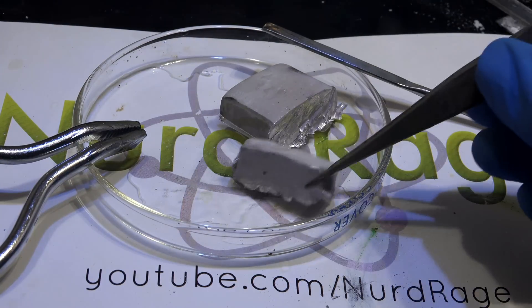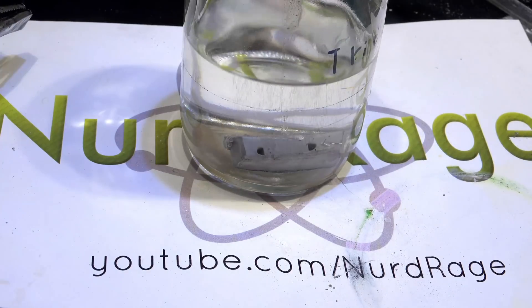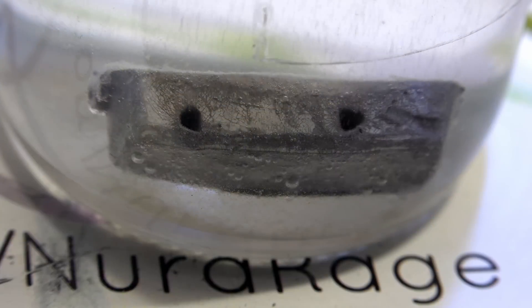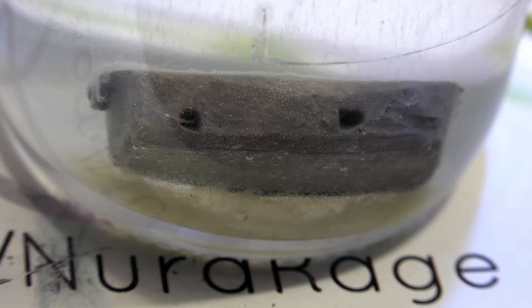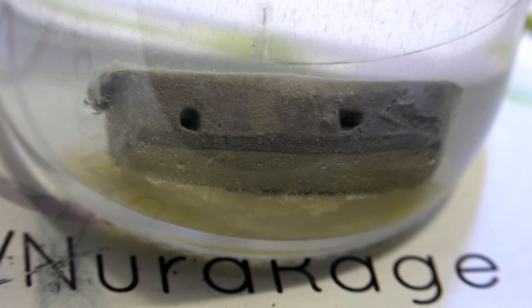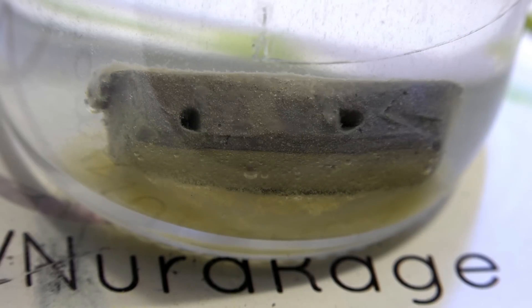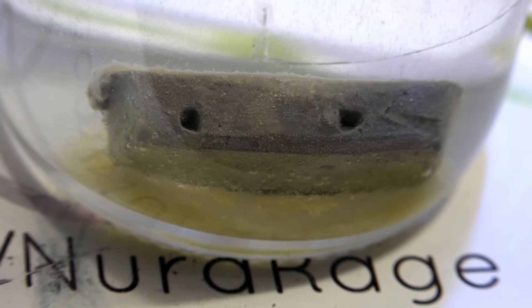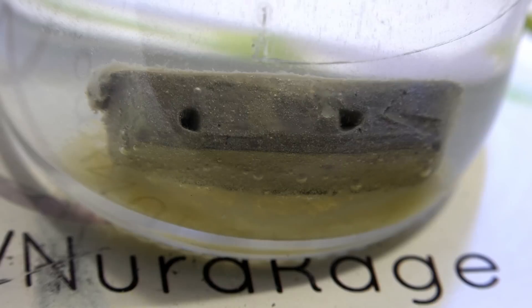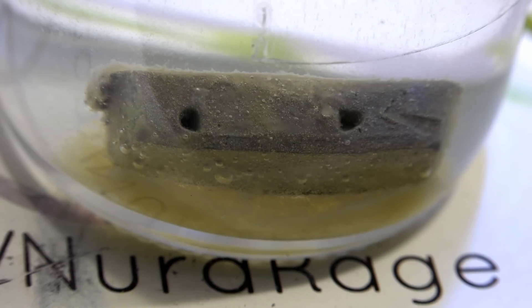Now let me drop it into the triethylamine. It's better to use multiple smaller pieces rather than one large piece, so cut down further if you can. You can see lots of bubbles of hydrogen gas rising off the surface. This shows our triethylamine has a significant amount of impurities. Most of this is from water that diffused in from the air over the past several years this was stored. A small amount is from ethanol and other decomposition products.